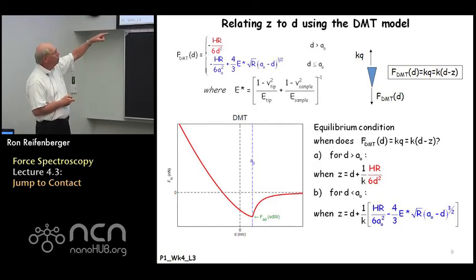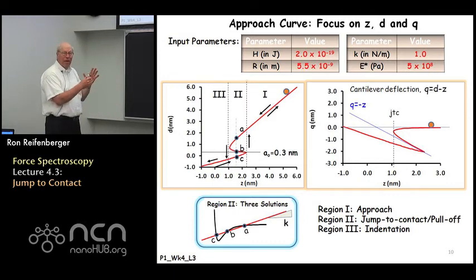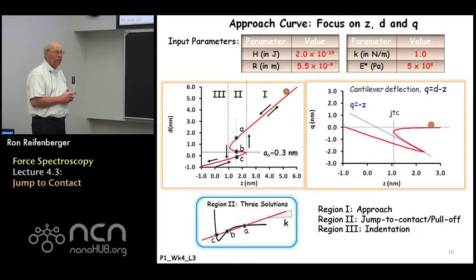And so I have 2 equations that I can plot, Z versus D. I just go through that exercise on the next slide, which is, again, output that Veda can achieve. But I wanted to show you how it gets that result, and I wanted to discuss what it means in a real simple way.